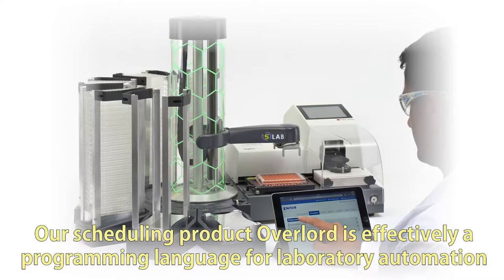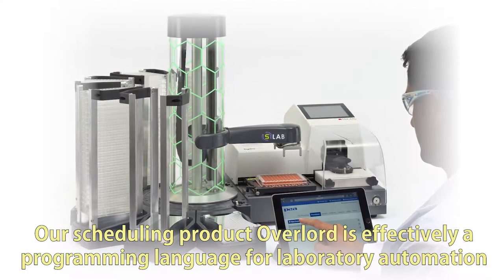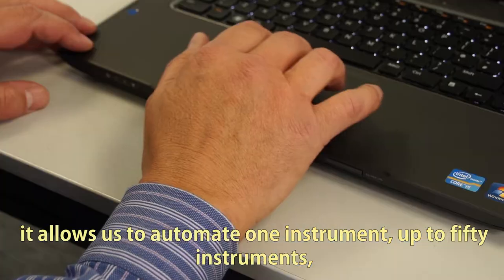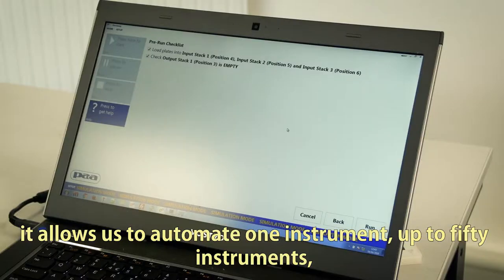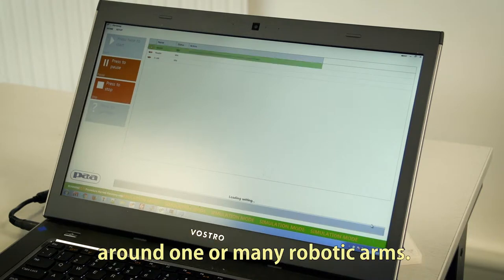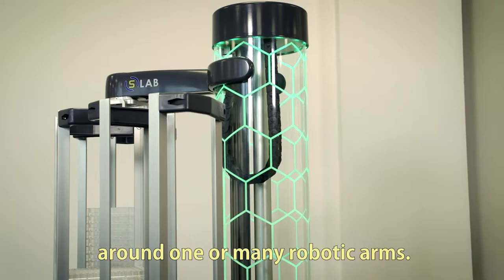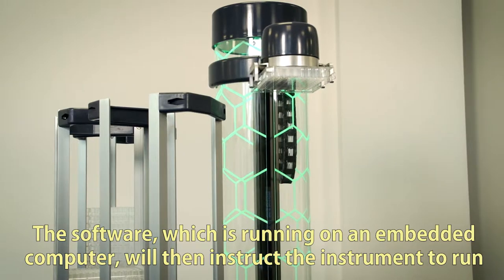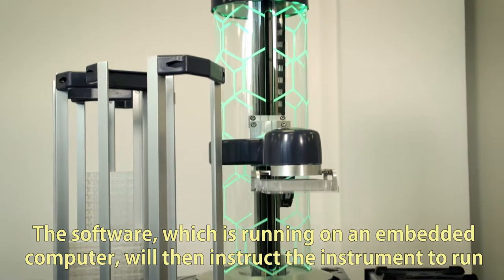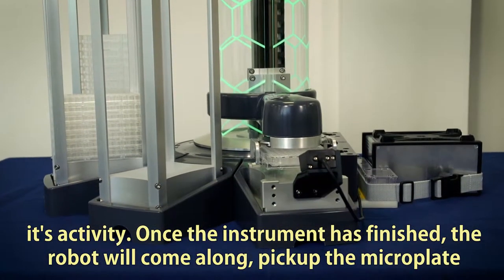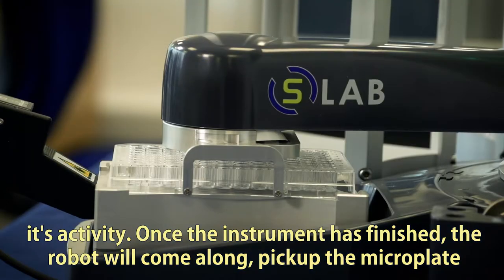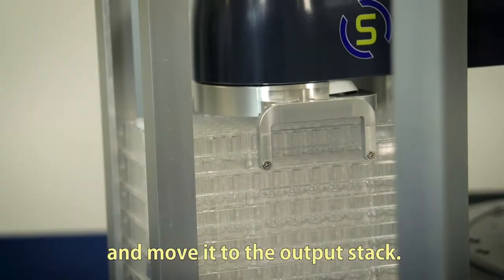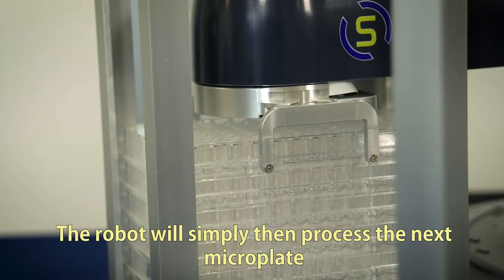Our scheduling product, Overlord, is effectively a programming language for laboratory automation. It allows us to automate one instrument up to 50 instruments around one or many robotic arms. The software, which is running on an embedded computer, will instruct the instrument to run its activity. Once the instrument has finished, the robot will pick up the microplate and move it to the output stack.